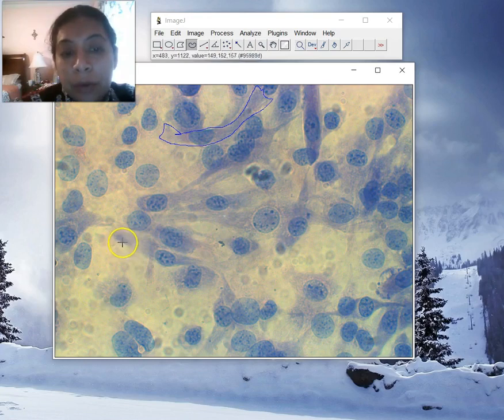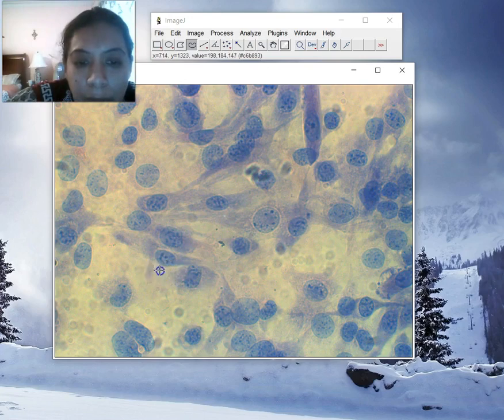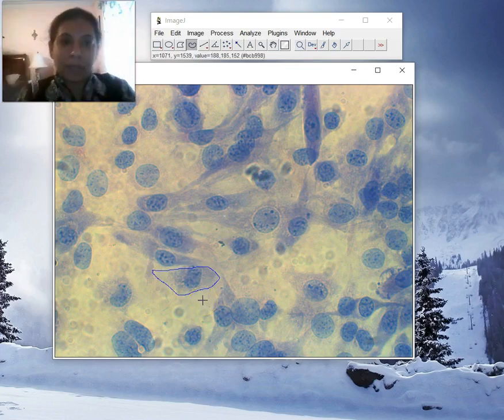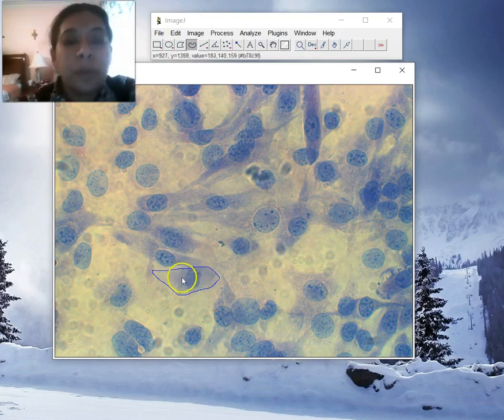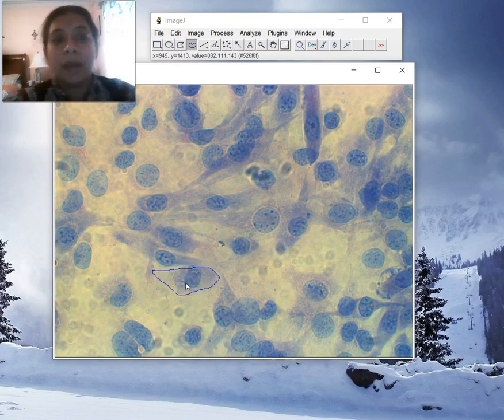If you look closer, you will see other cells that are on the borderline. If you look at this one, for example, this was not a very good drawing from me, but it is still kind of boxy, yet at the same time it seems to be getting a little bit pointy on the edges. It's beginning to elongate, but we don't know where that would fall. So we wouldn't know exactly which category to put it in if we just had cells that were completely undifferentiated and cells that were beginning to elongate and show signs of differentiation.